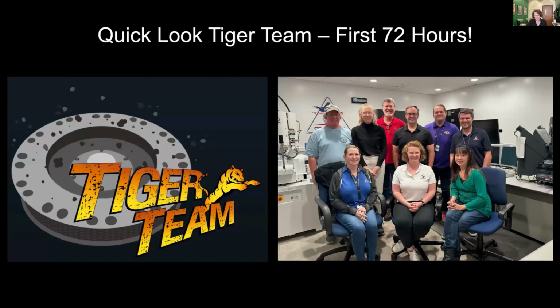Now, I was very fortunate to be a part of the Tiger team, which was a group of scientists assembled almost like the Avengers in order to do the first 72 hours of sample analysis. They scooped up some of that material from the avionics deck, delivered it to us, and we had 3 days to do as much microscopy on the samples as we possibly could so that we could understand what its composition was, what its microstructure was, to report out to the press, to report to NASA, but also to tell the rest of the science team what the sample looked like. So that could help them guide what materials they wanted to request and what samples they wanted to analyze.